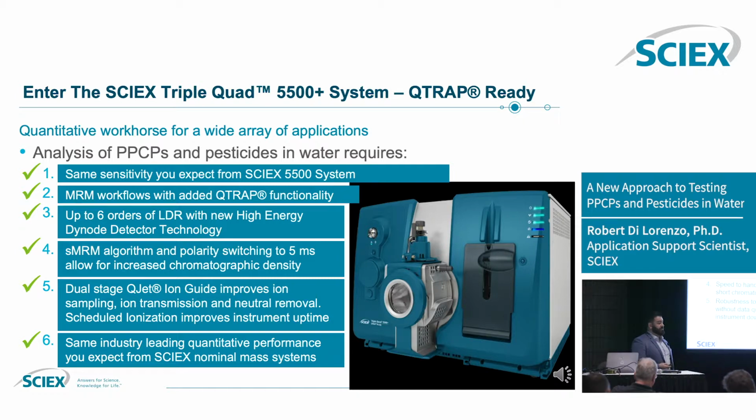And one of the things definitely is not just your data quality. To get that back, your instrument's going to have to go down, and nobody wants that. And finally, accuracy and precision to underscore those scientific decisions being made.